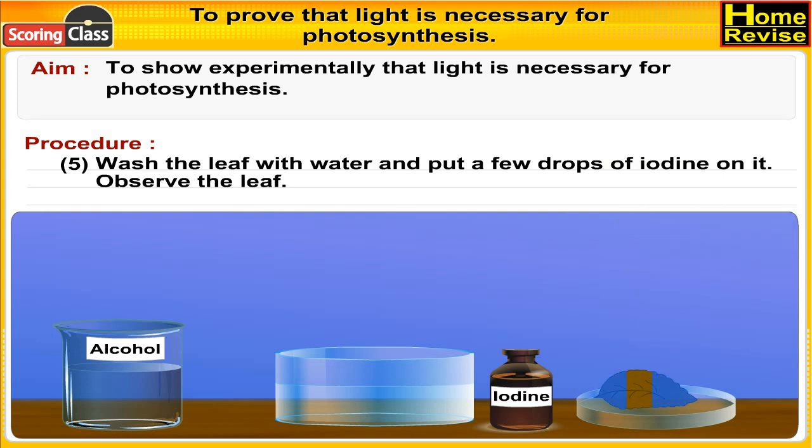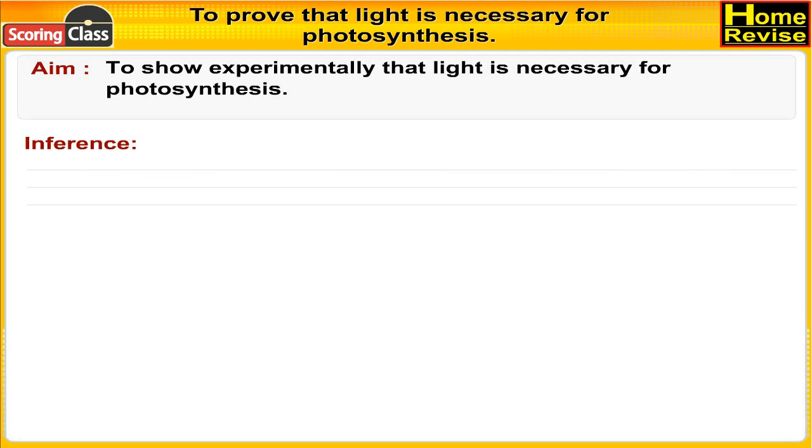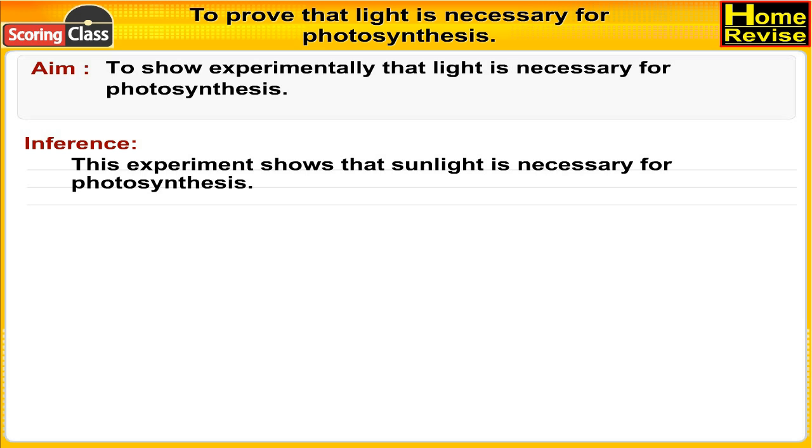Wash the leaf with water and put a few drops of iodine on it and observe the leaf. Observations: the region of the leaf which was exposed to sunlight turns blue in color, while the region covered with the black strip turns brownish in color. Inference: this experiment shows that sunlight is necessary for photosynthesis.